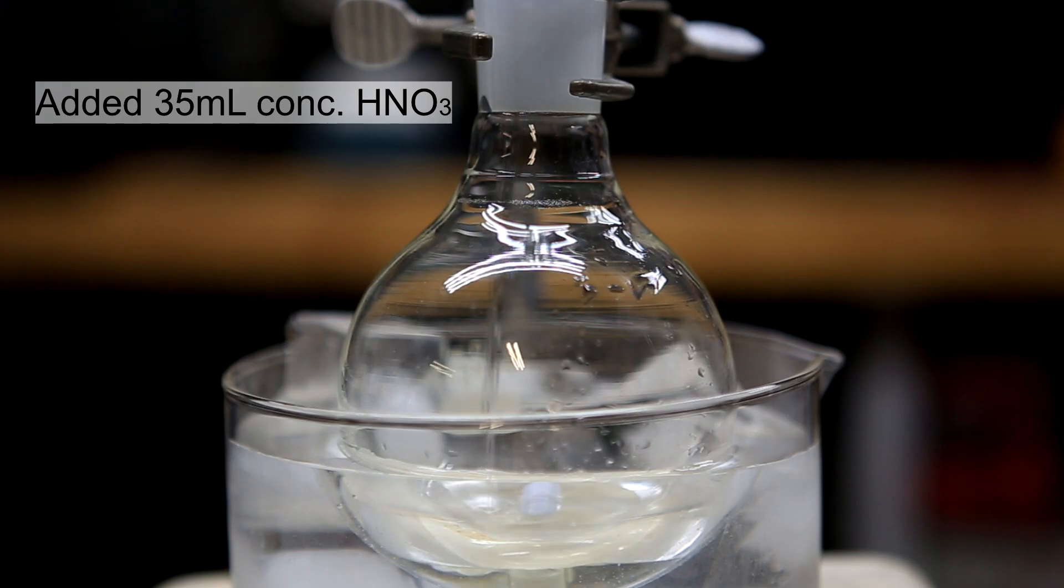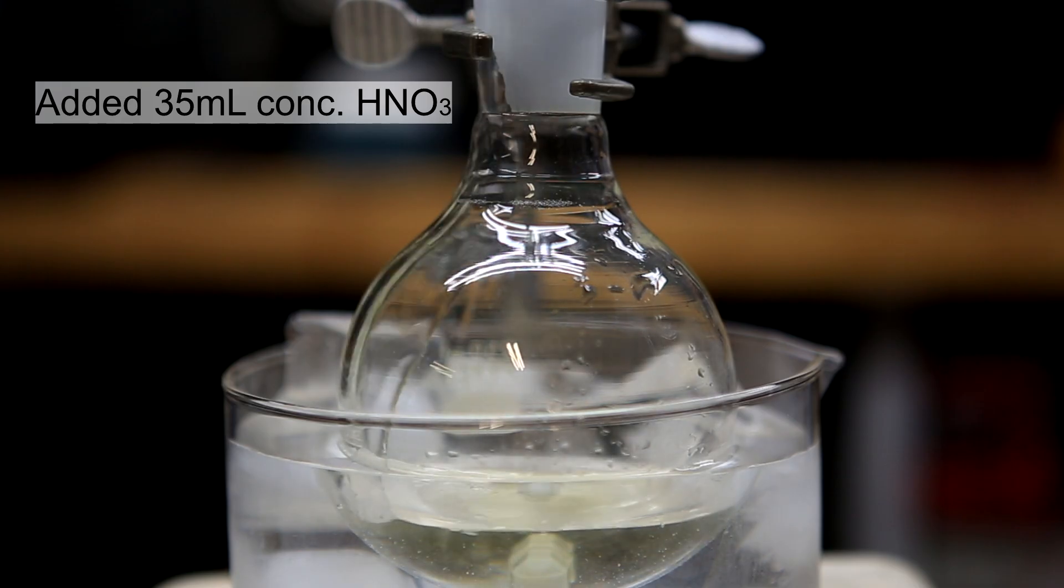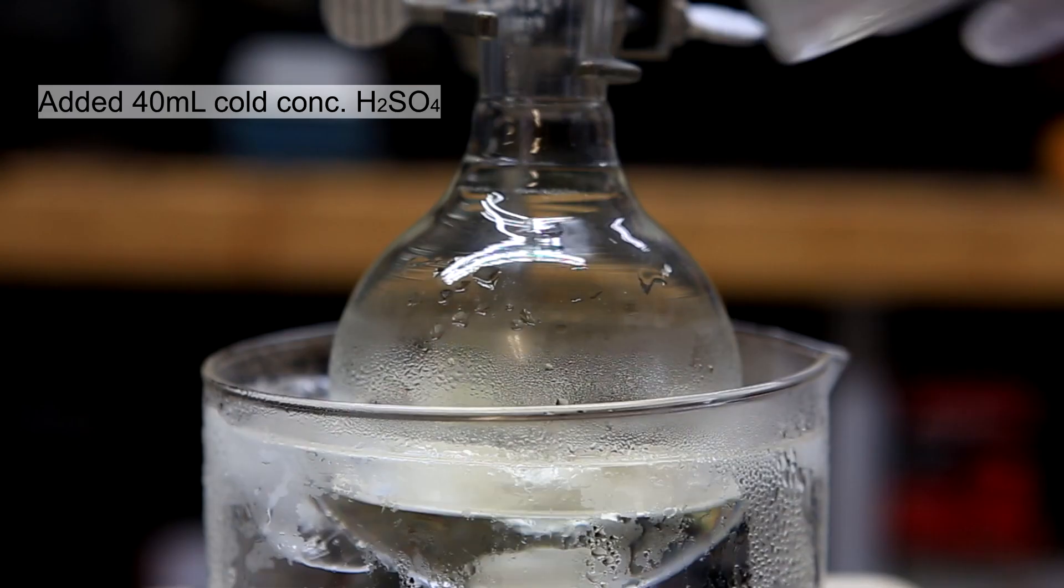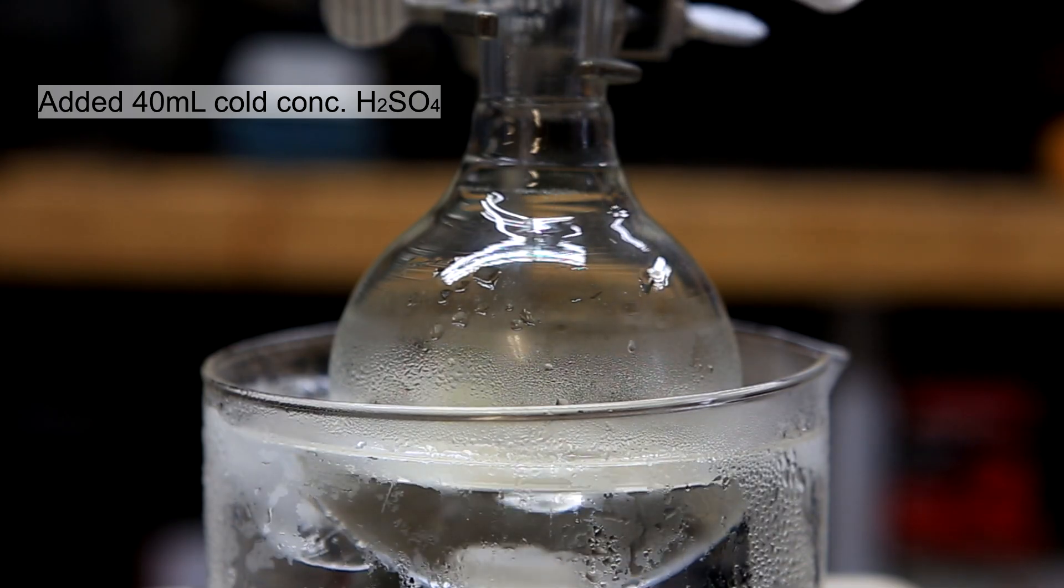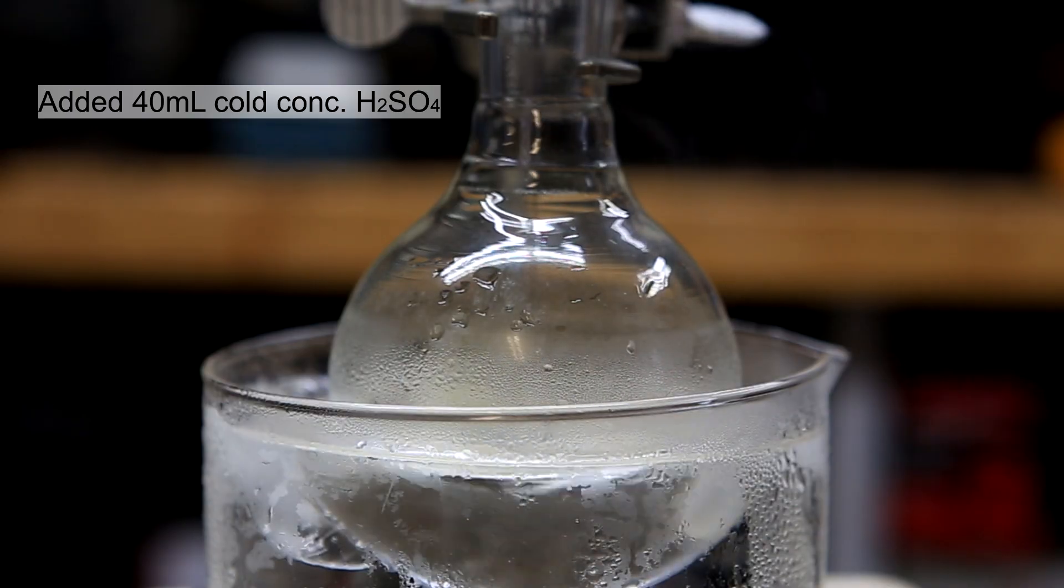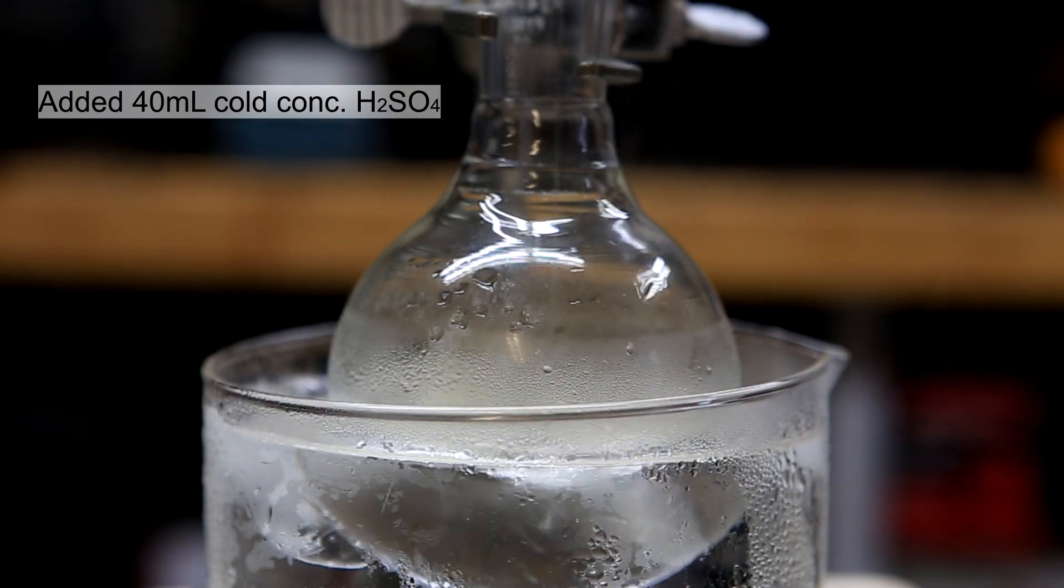35 milliliters of concentrated nitric acid was added to a round bottom flask. With stirring was added 40 milliliters of cold concentrated sulfuric acid. The sulfuric acid was cooled by putting it in a freezer for about 30 minutes.